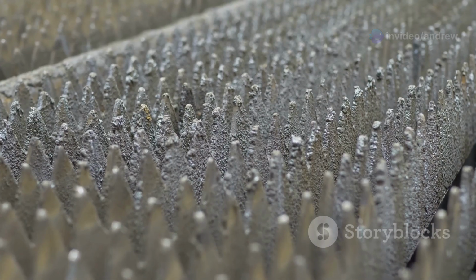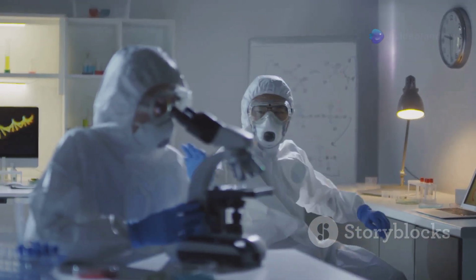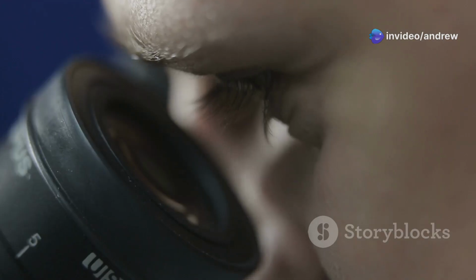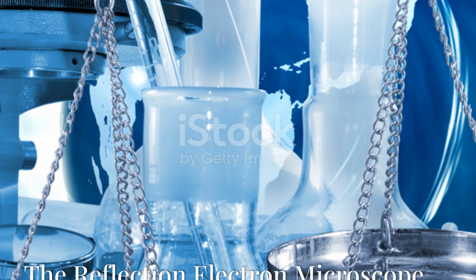SEM images are typically three-dimensional and show the surface topography of the specimen in great detail. SEMs are used in a wide variety of fields, including materials science, biology, and forensics. For example, SEMs are used to study the fracture surfaces of materials, the morphology of cells, and the composition of gunshot residue.